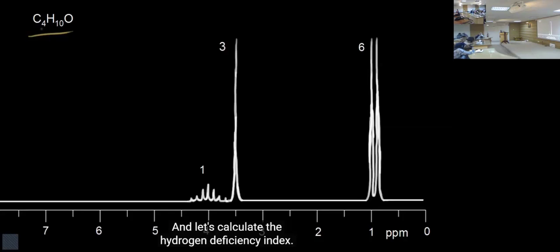Because when you're assigning, there are multiple factors for one particular structure, but in general, just have some idea of where the protons around which functional group should resonate. I would recommend you memorize these chemical shifts, because this is the first clue that you get, other than the splitting pattern, of where this particular proton should appear and what the range is.